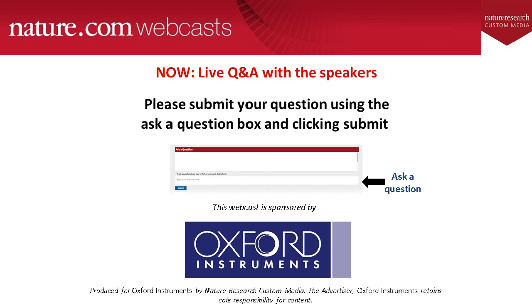It's a good question, and thank you for it. I'm aware that many SEMs, particularly those that are doing 3D SEM, use variable pressure or environmental pressure settings within the SEM to help with charging samples. However, for our windowless detector, it's not advised to use it in those conditions.